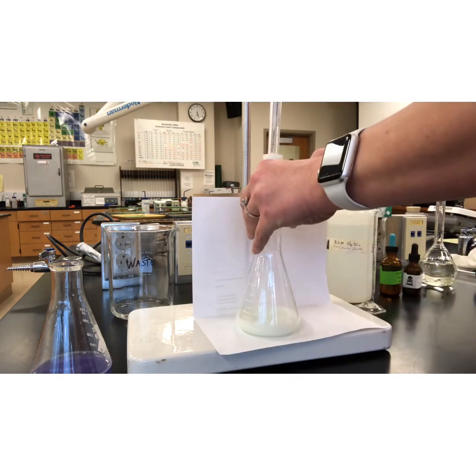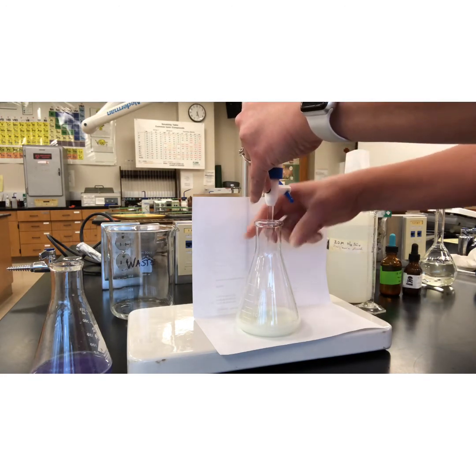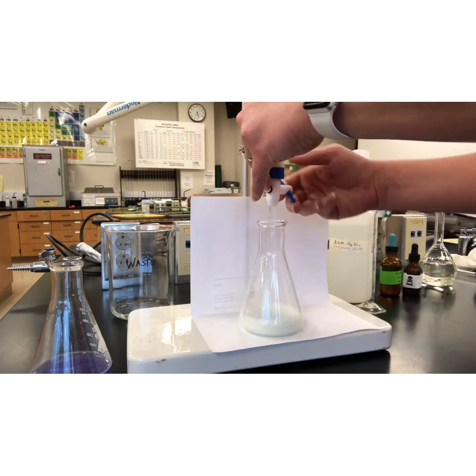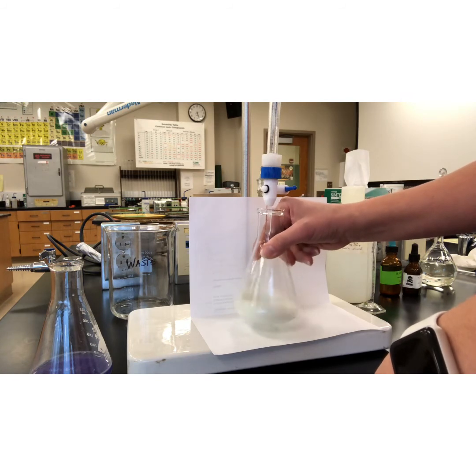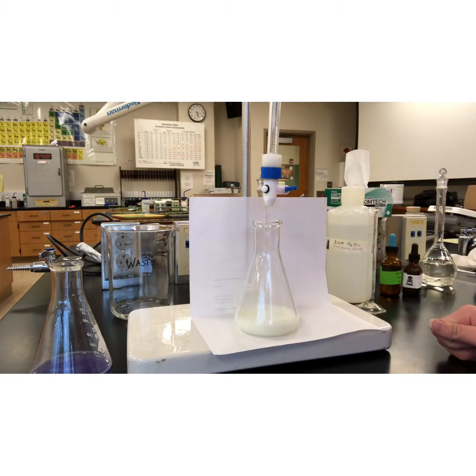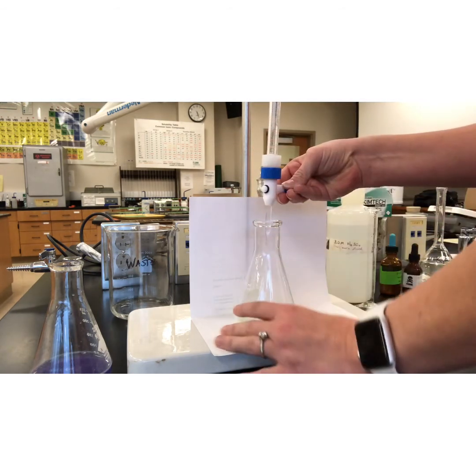Okay, let's see, we're just over 15 milliliters. Yeah, able to add quite a few more before we see that big color change. All right, now we're really close. I'm just above 18, so I'm close to that 19, so I'm gonna go ahead and slow it down so I don't overshoot my endpoint, because no fun repeating our work.